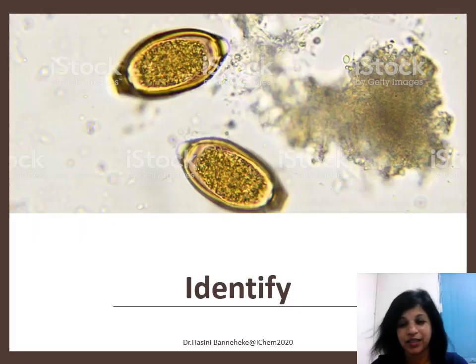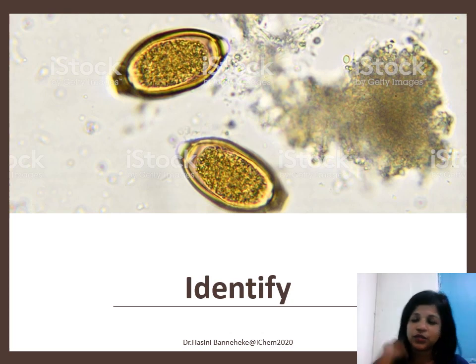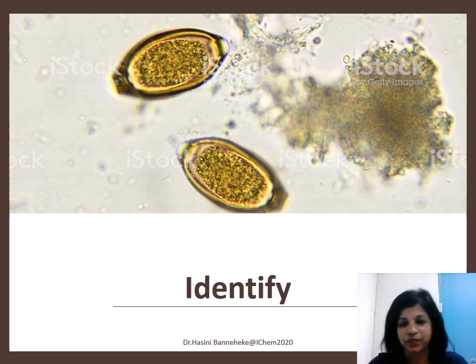So this is one of the easy spot tests for students because it's quite easy to recognize this structure, as there is no confusion with any other structure. This is again present in fecal material, again from a normal saline smear. You can see the shape and the other internal structures, which will help you to recognize which species it belongs to.